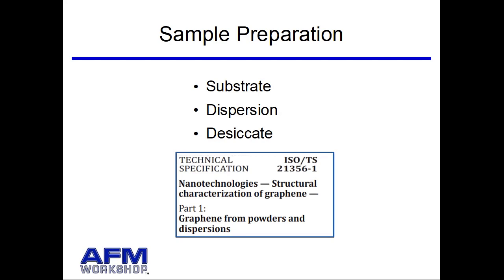I'd like to point out that there's a very good technical specification. It's ISO 21356-1, and this is available publicly, I believe. If you can't find it, you can contact us. We have a copy of it. I think we're allowed to give it out.